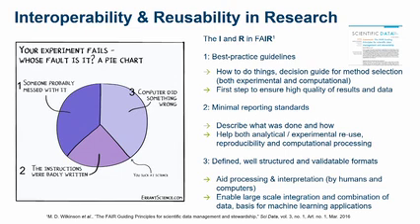And I also would like to highlight, coming back to some of the discussions we had earlier, that having the data in these formats that you can then submit is also helpful for your own lab, for example, because you can then use standardized tools and algorithms to reanalyze your own data and also do things within your own lab across your old previous studies, for example, that you would otherwise have a hard time doing.